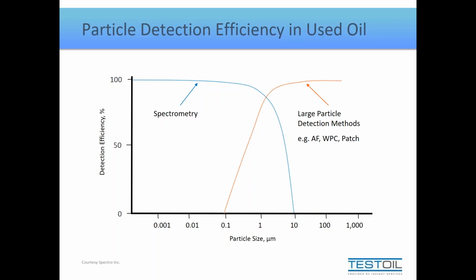The other way would simply be to run the sample twice. If you can't reproduce the values, that's a pretty strong indicator that the water contamination is significant enough to affect the accuracy of the result, because it doesn't give a constant bias. When water does skew the result, it skews it very abnormally. That's kind of your two-sided answer there. So no, there's not a set level. There's not a cutoff point where you would know definitively it's going to cause a problem. But like I said, you can avoid a lot of that by choosing an appropriate solvent. And if you're ever in doubt, run it in duplicate, and you'll have a pretty solid answer.